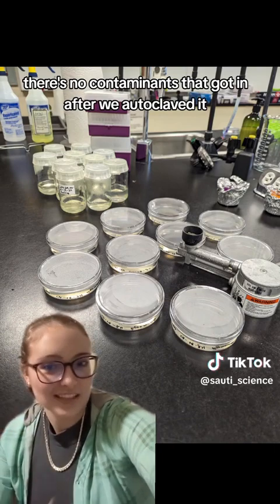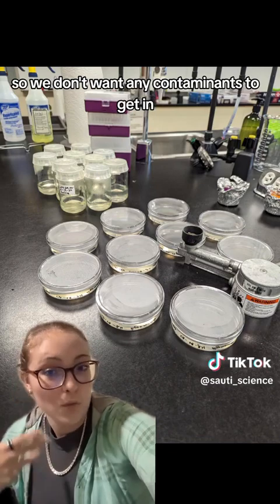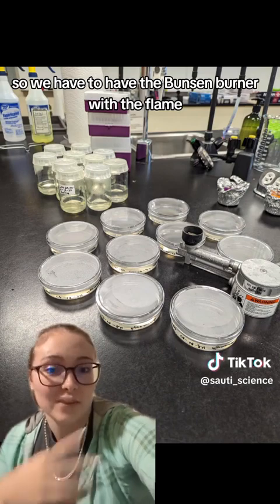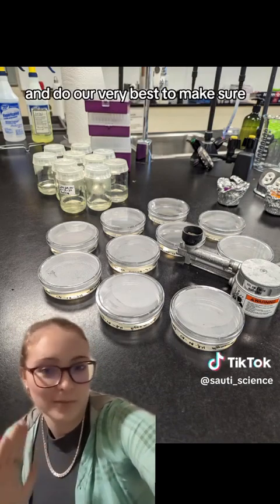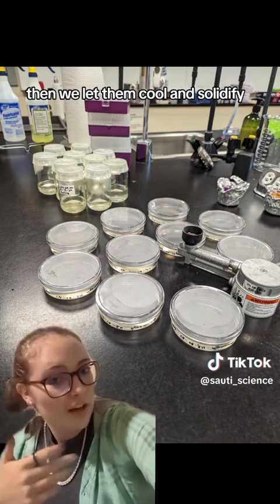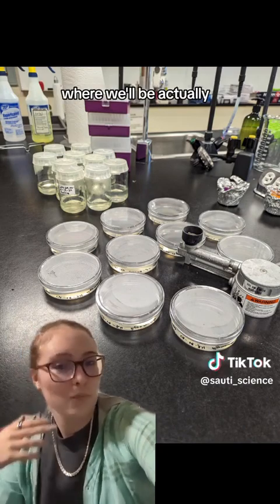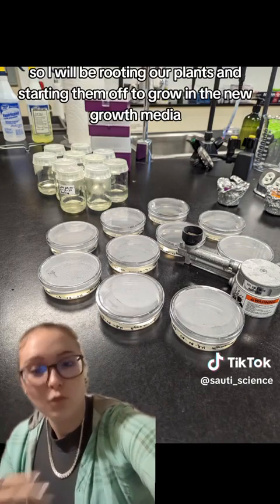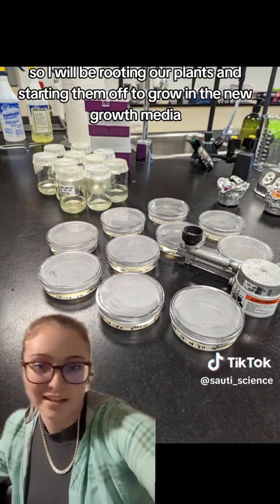We had to use sterile technique to make sure no contaminants got in after autoclaving, since we can't autoclave again. So we used a Bunsen burner with a flame, used ethanol to wipe down the whole counter, and did our best to make sure no bacteria or fungal cells got onto the plates. Then we let them cool and solidify and stored them for next lab, where I'll be rooting our plants and starting them off in the new growth media.